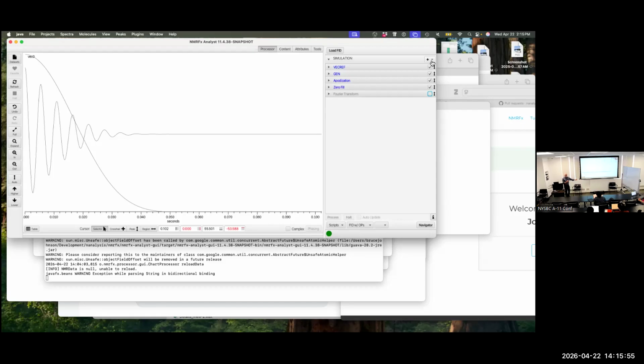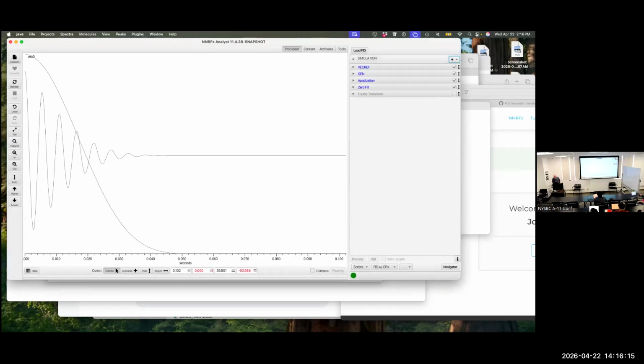So if you can skip some of those, you're going to save time, and that's the concept of non-uniform sampling.